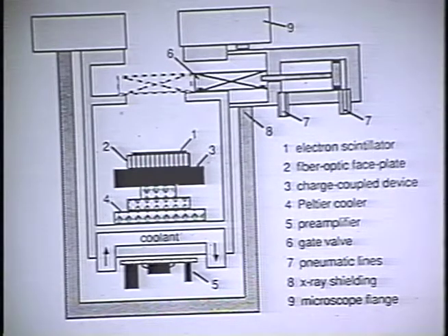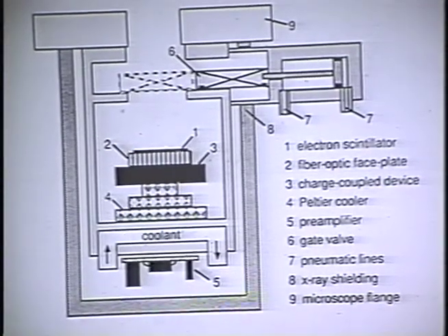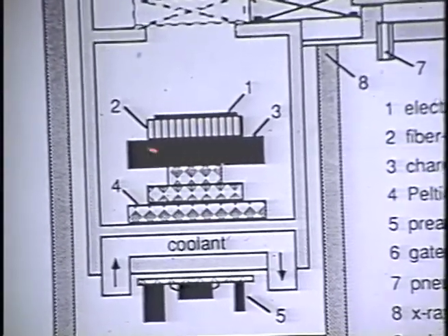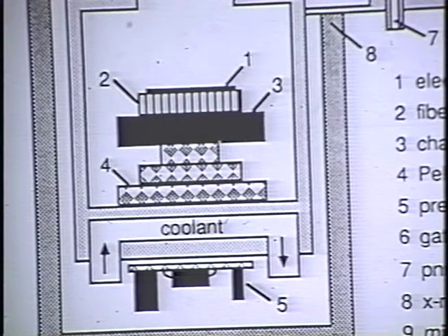Now, as Ken pointed out, the actual lateral resolution that you get in your imaging ends up being proportional to the thickness of your scintillator or phosphor coat. That's why the YAG is thinned down to 20 microns, to match the 20 micron pixel size of the CCD, giving an optimal resolution.